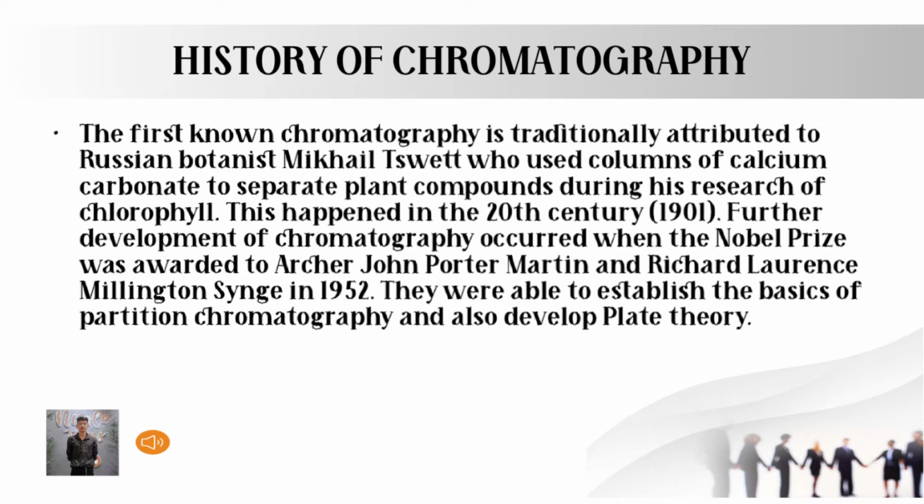History of liquid chromatography. The first known liquid chromatography is originally attributed to Russian botanist Mikhail Svet, who used columns of calcium carbonate to separate plant compounds during his research of chlorophyll. This happened in the 20th century, in 1901.